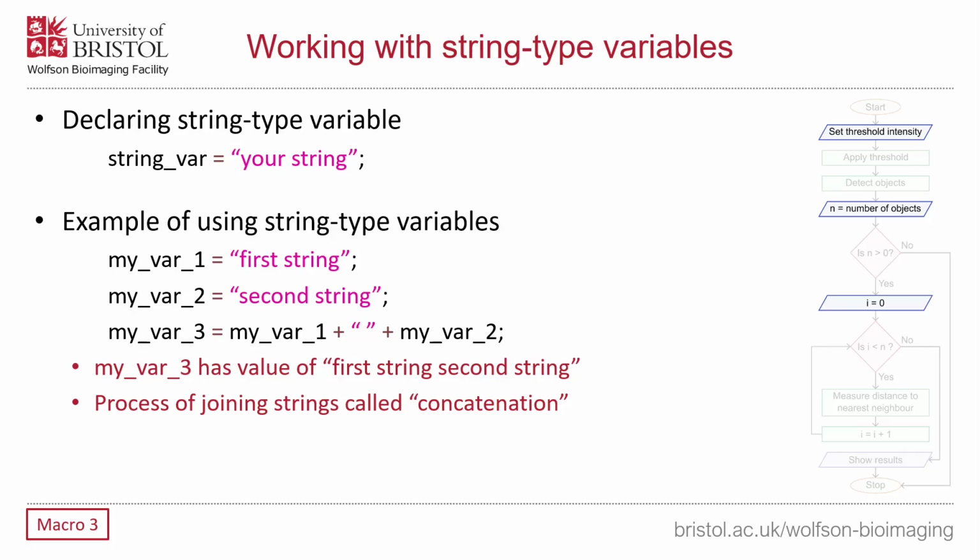And with a couple of exceptions, ImageJ will just take that as is. So here we're allowed to start it with numbers, we're allowed to have white space characters, we're allowed to have symbols. There are a couple of symbols which will make it behave differently. Backslash is one, but you can read more about that online. It's sort of beyond what we're really interested in for this sort of initial introductory look.